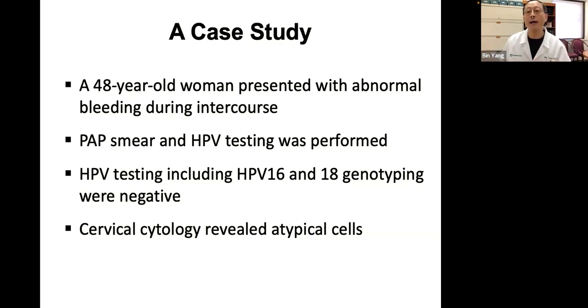Now, our lab started 8 years ago, 3 years after that publication, and we started to adapt to that, and now it's become routine. For junior faculty, they may have 30% among all their ASC, but a senior one, practicing like me, 30 years, my rate is going to be higher, and some are even higher.